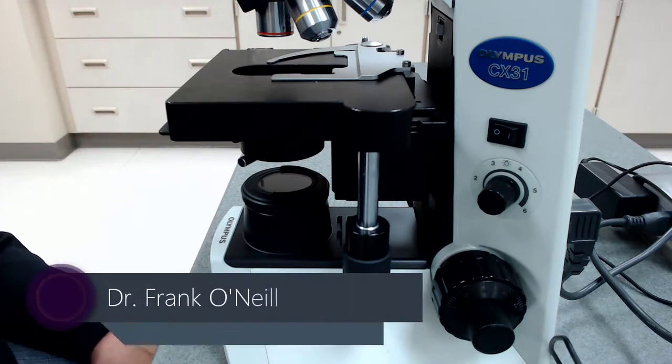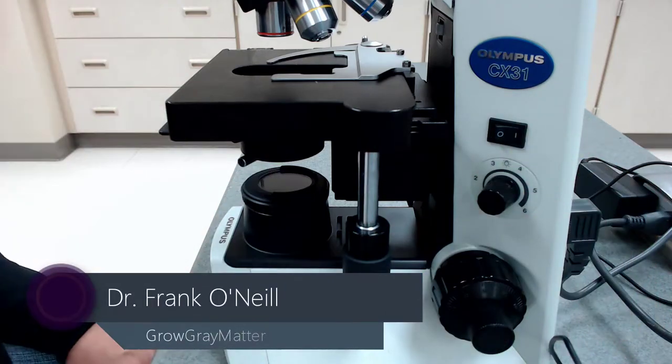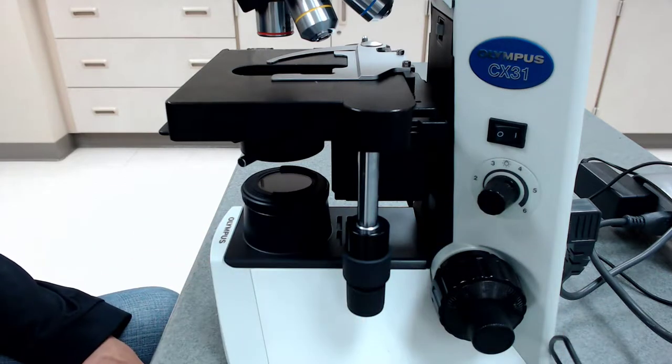It may not be the microscope you have, but most of the parts are going to be the same. So first, we have an on-off switch, like any other on-off switch. It controls the power, but there's also this rheostat or dimmer switch here.